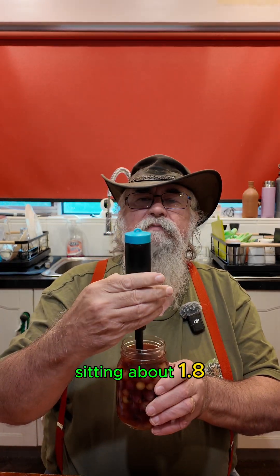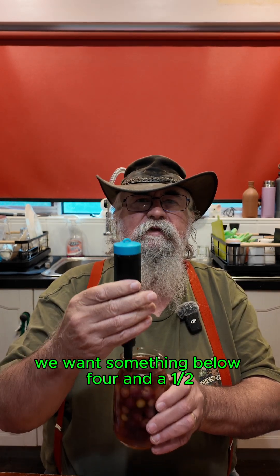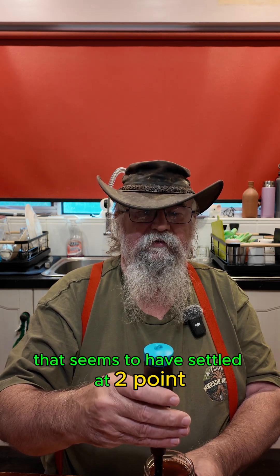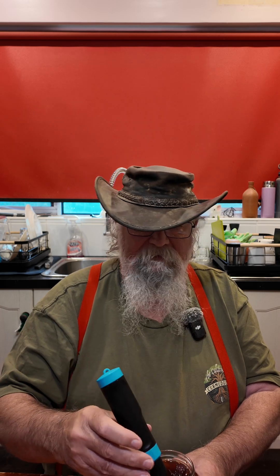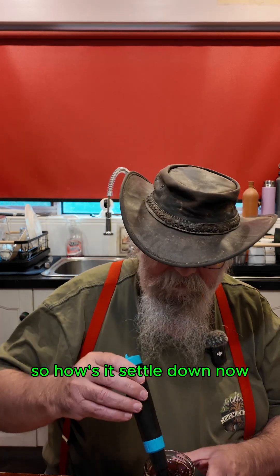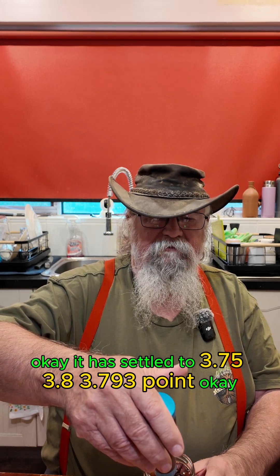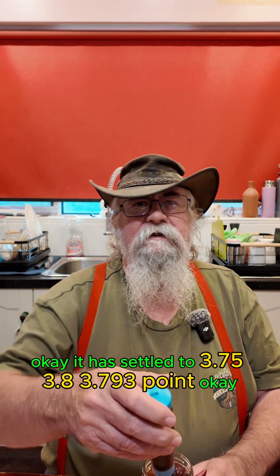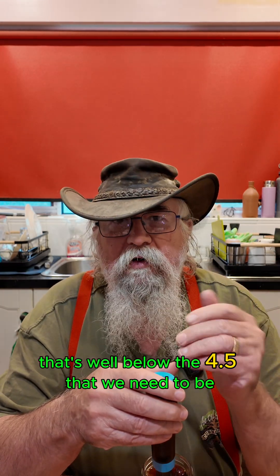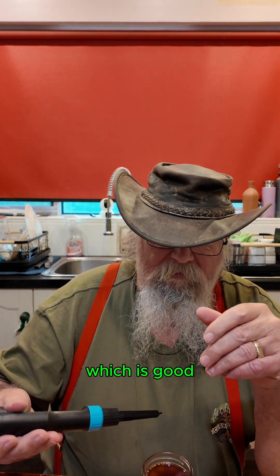I'll have a look. It's sitting about 1.8 and it just keeps going up — we want something below 4.5. I'll leave it sitting in there and have a look at our instructions. How's it settled down now? It has settled to about 3.8. Let's say it's about 3.8 — that's well below the 4.5 that we need to be, which is good.